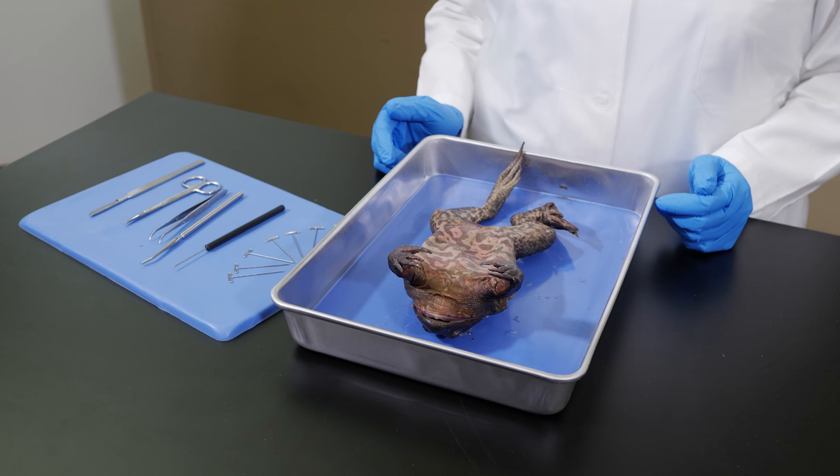In our last lab, we examined the external anatomy of a frog and the structures inside the frog's mouth. In this lab, we will continue our dissection of the frog so we can take a close look at its internal anatomy. To expose the internal organs of the digestive, circulatory, respiratory, and excretory systems, we first need to cut away some of the skin and muscle tissue covering the frog's body cavity.